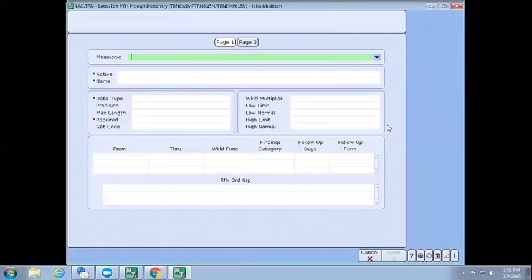And there are several different types of prompts you can define. I'm going to go over most of them. There's a date type, a free text, signed decimal, integer, time, yes or no, and I'm going to go over those individually. And then there's also a path medical term type. This one I'm not going to show for today, but it is basically just used to get codes from medical terms that are defined in questionnaires.